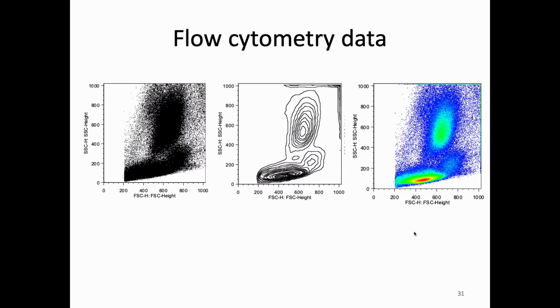Yep. So you said you don't run our cytometer that fast. Yes. What's the harm in running it faster or slower? Then it clogs, and the last time it clogged, it didn't work for 9 months, and I had to pay $5,000 to fix it myself.